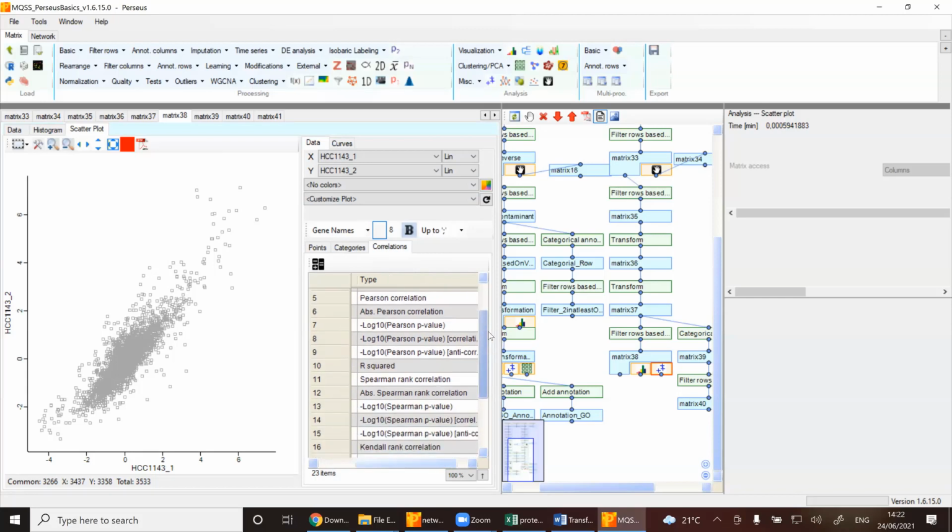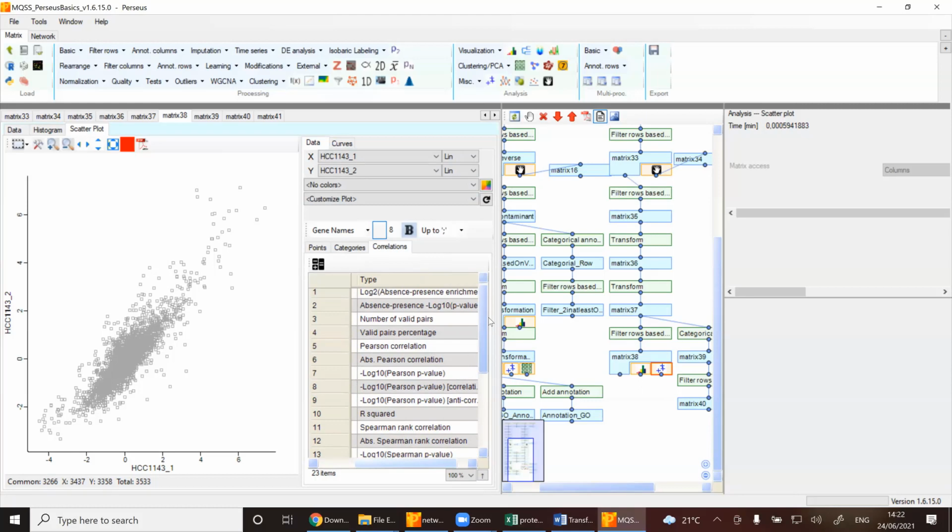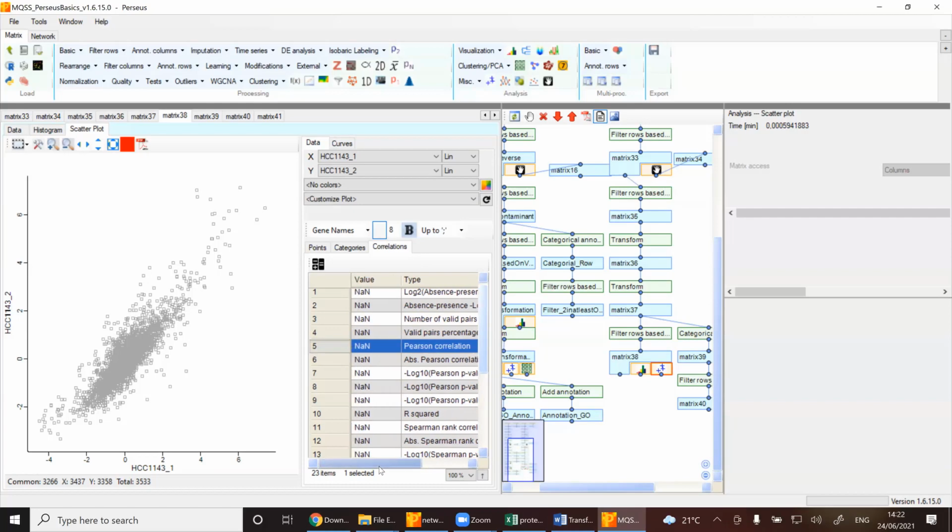And again, you have to think about what makes sense, and this also depends on the type of data. Are they normally distributed or not? Let's say one usual thing one does is the Pearson correlation. So you just mark the Pearson correlation here, then you go to this equation button and say okay, and it gives you the Pearson correlation, which is 0.87.